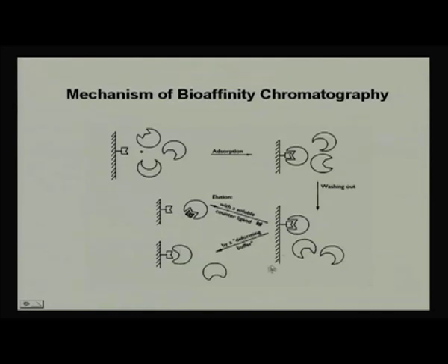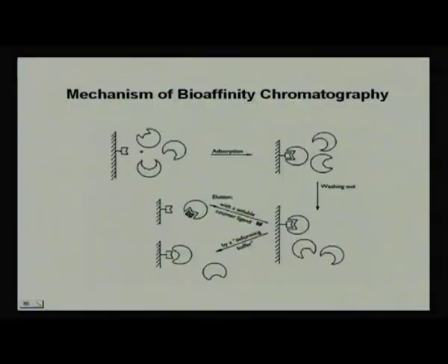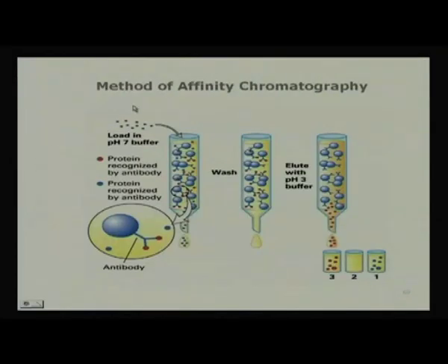And this way, this biological affinity, which is an inherent property of biological macromolecules or micromolecules, is getting exploited by scientists. This is the method of affinity chromatography.